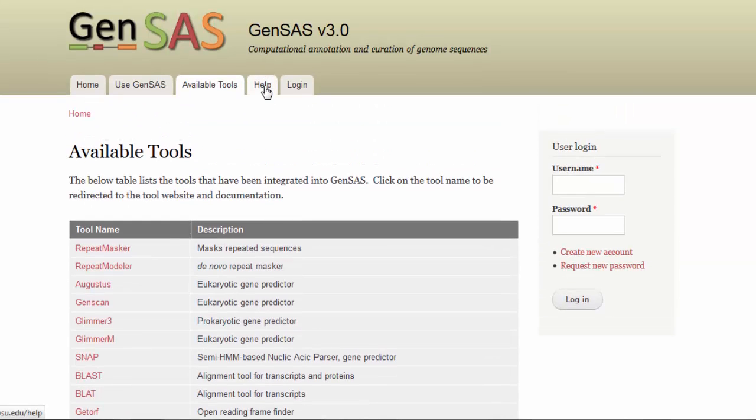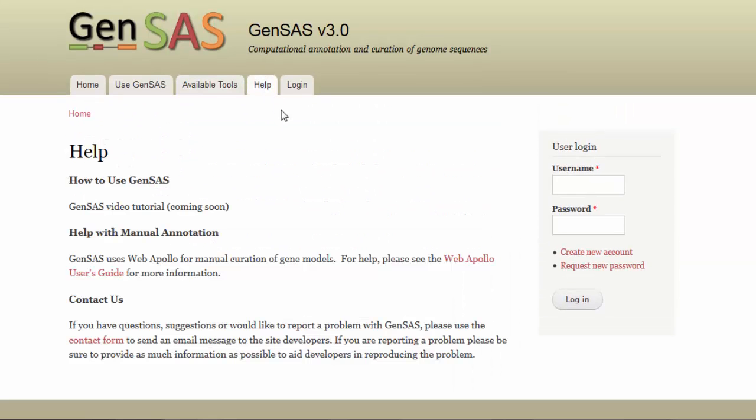Under the Help tab, there are links to tutorials for GenSaaS and WebApollo, and a contact form where you can submit questions and report technical problems.